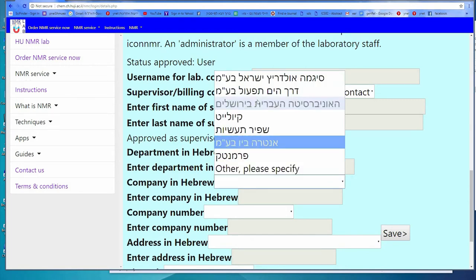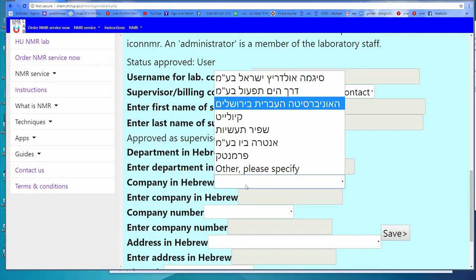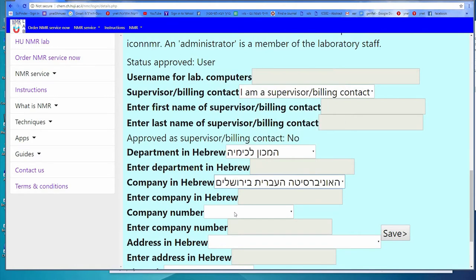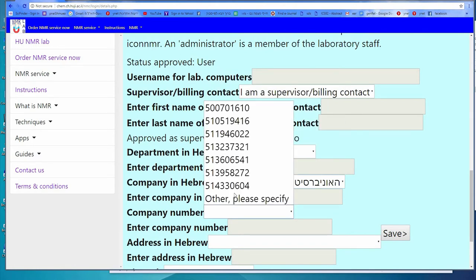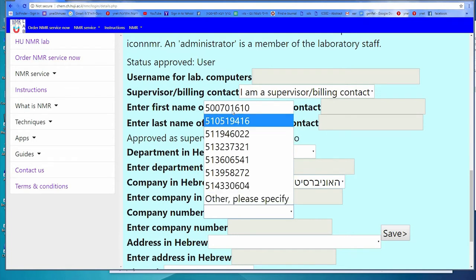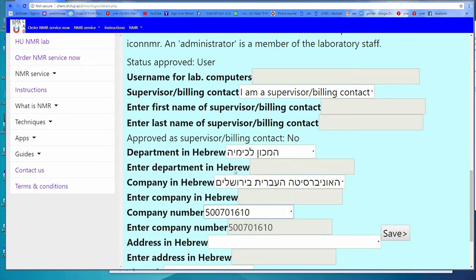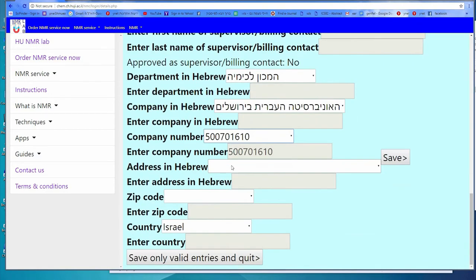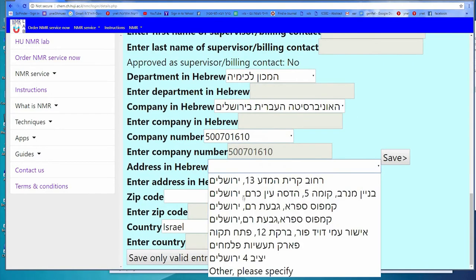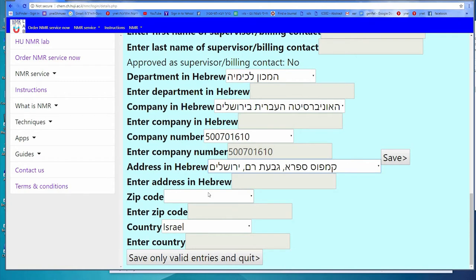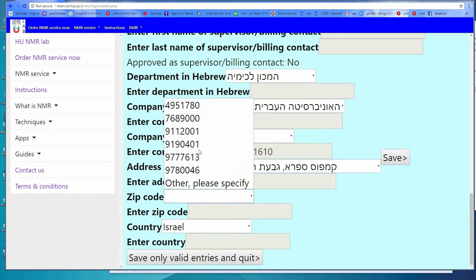The company number for Hebrew University is 500701610. If you are a private individual, please enter your name again and your ID number. You need to enter your address, select or enter it, and provide your zip code and country.